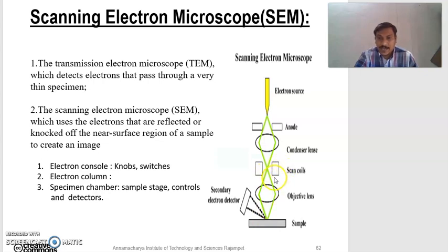So next, the apertures. Below the condenser lens, apertures are available. These apertures are used to reduce and exclude extraneous electrons in the lens. Below the scanning coils, another aperture is available. This aperture is used to determine the diameter of the electron beam, or spot size of the electron beam.